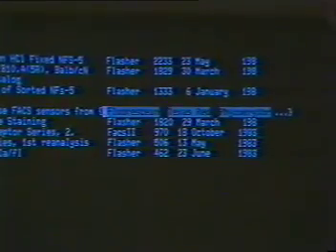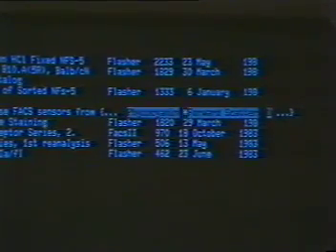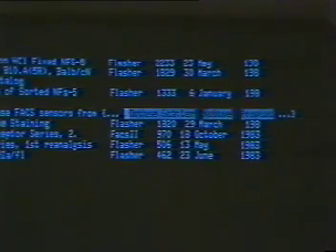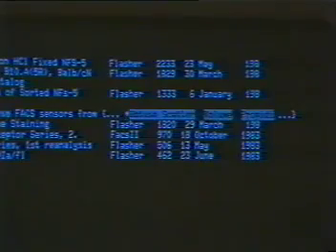Watch again as we choose the sensors for this sample protocol. Using the Select key, we choose Fluorescein and Texas Red. Then, with the word Right key, we scroll past the next 3 sensors in order to select Forward Scatter and Obtuse Scatter. Now that we've chosen our sensors, we press Return, and the Magic Secretary instantly installs the new drawer. It is in protocol mode.